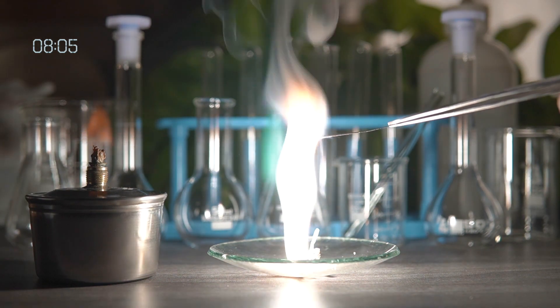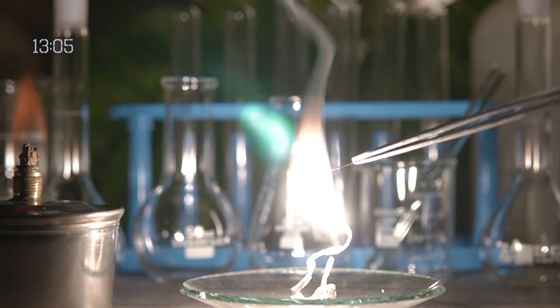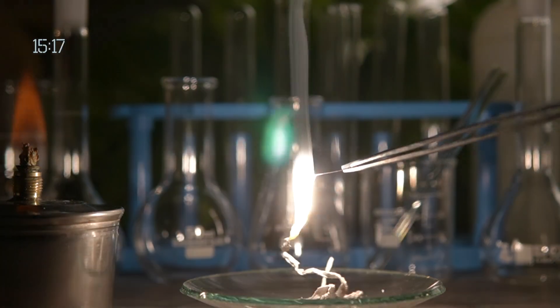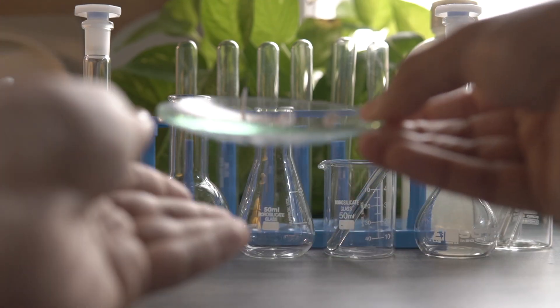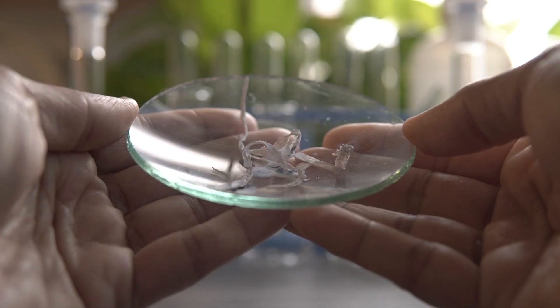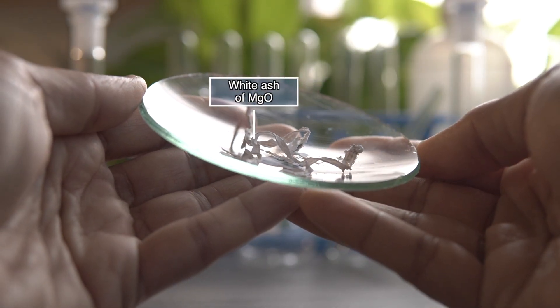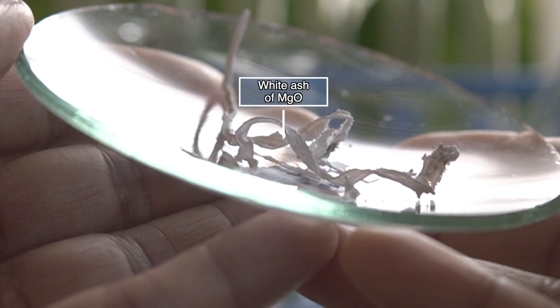Within a few seconds it will start burning with a dazzling white flame. The white ash that has been formed after the reaction is nothing but magnesium oxide.